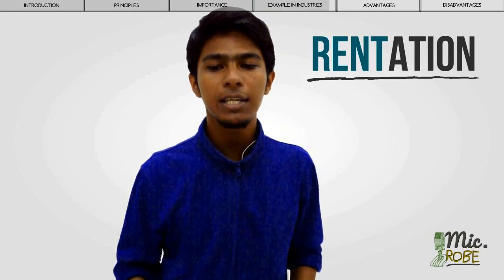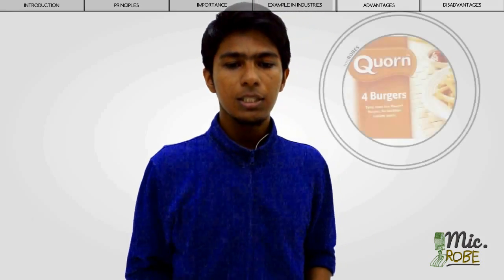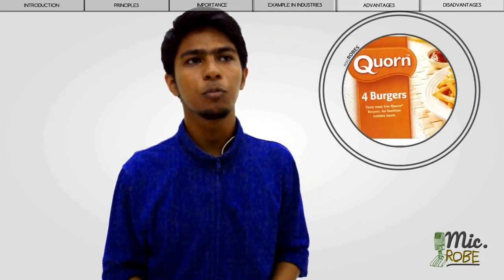This causes the bacterial cells to be immobilized in the reactor to maximize their retention and increase the productivity. Okay, the example of using this continuous bioreactor is Quorn.